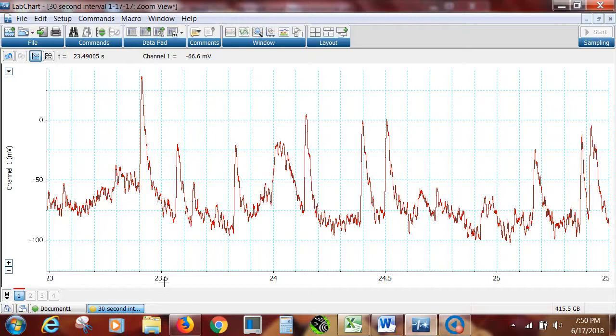Now 23.5 to 24. Right when if it hit it in its rise, we count it, but that one's kind of on the border. But let's count the next ones. So this might be 1, 2, difficult here, 3, and that one really didn't happen yet. So that one I'm just going to say 23.5 to 24 is 3.